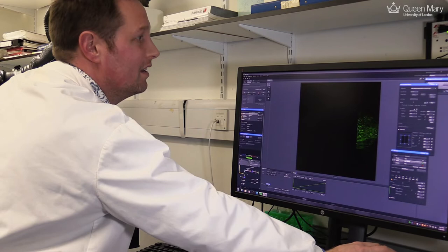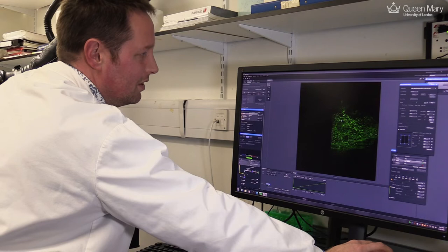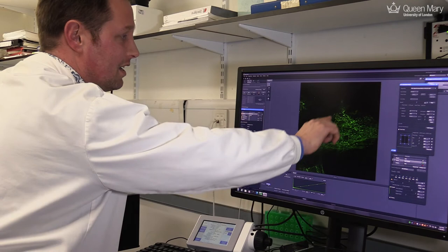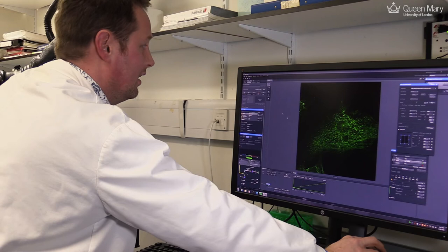So here we are taking an image of the cytoskeleton, in green. If I make that a little bit faster, then it would be more interesting. We're scanning it point by point to reconstruct the image. You can see the nice cables that form the cytoskeleton of the cell in there.